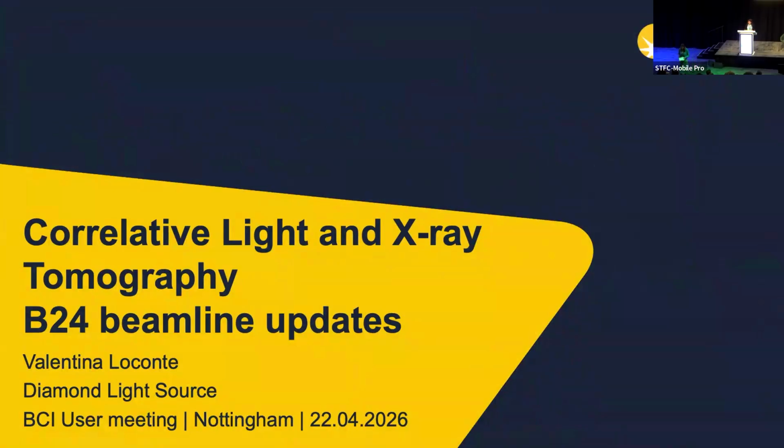Good morning, everybody. Thank you very much for joining us for this meeting today. I'm going to give you some brief updates on B24 Beamline. We are basically correlating light and X-ray tomography on our Beamline to explore the cell at the mesoscale. I'm going to give a brief introduction to those who are not familiar with the Beamline, and provide some background on the reasoning why we're using soft X-ray to explore samples, and then I will provide some outline of the instrument and some updates that have been taking place during the last financial year.